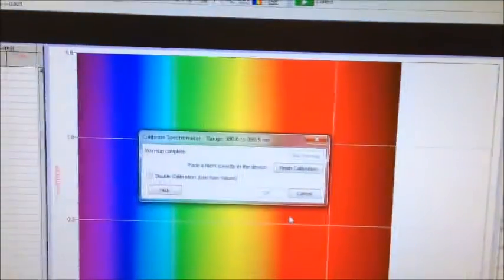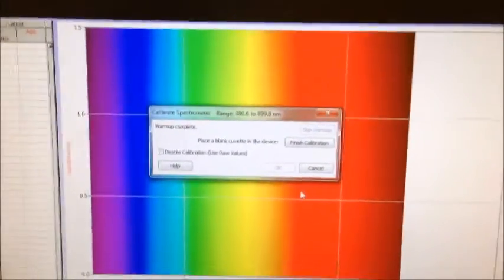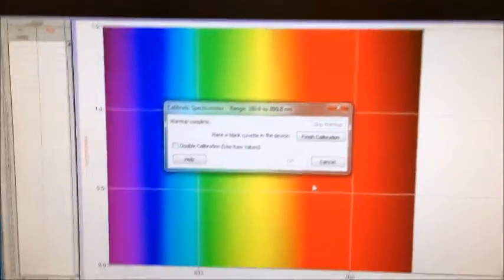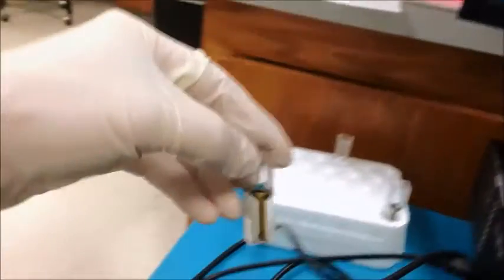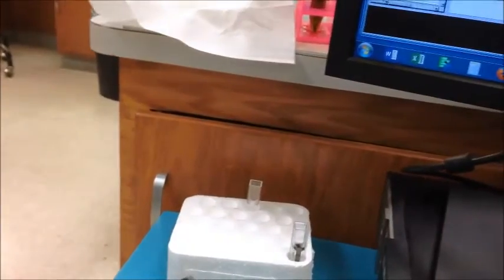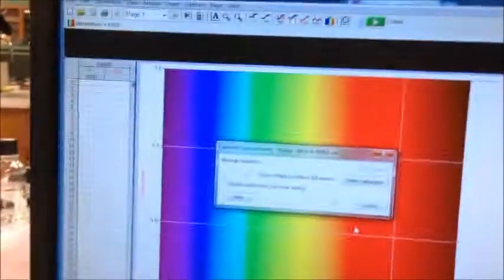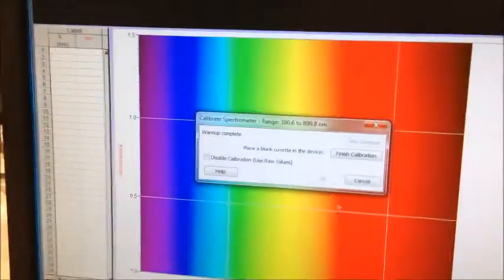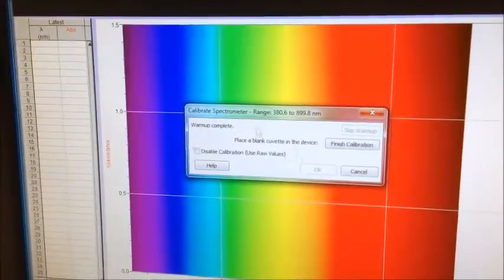So what I've done so far is to go ahead and let the spectrophotometer warm up. Now I have a sample here that has some of the brown Bradford reagent in it and that's my blank. So I'm going to go ahead and click on finish calibration.